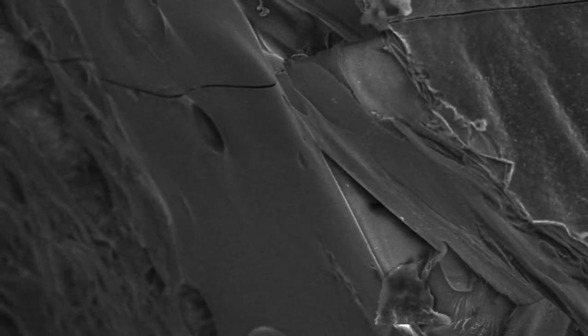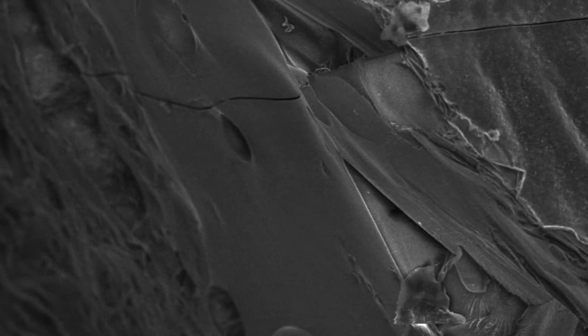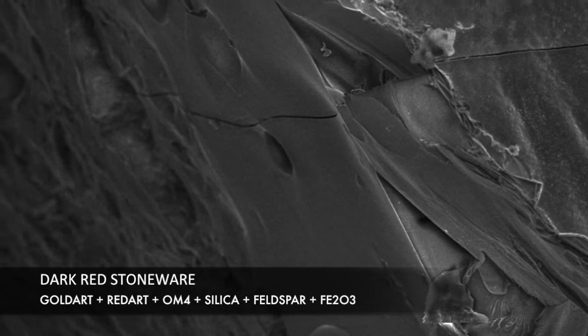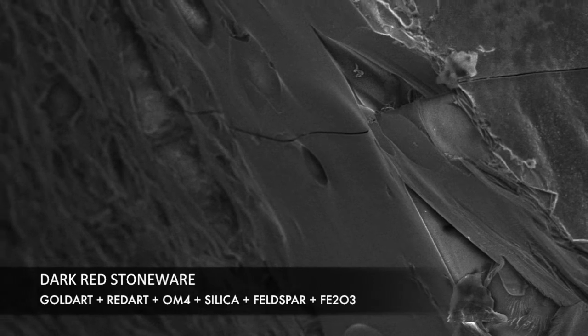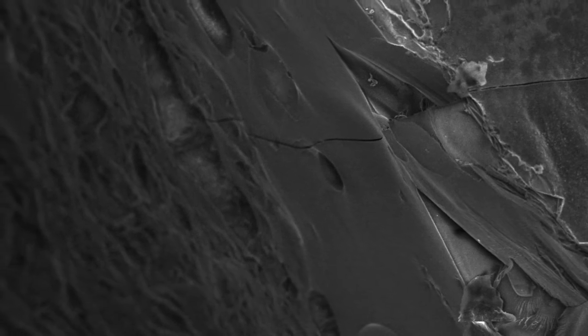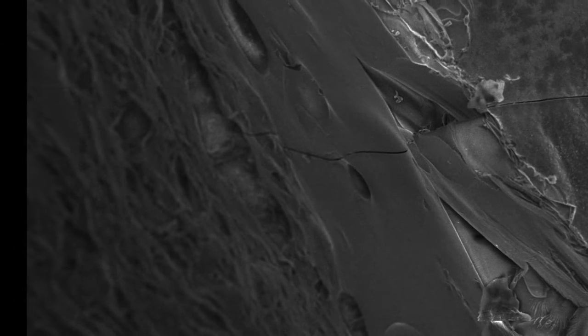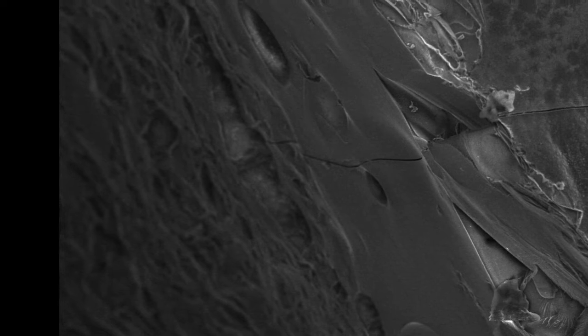And then as we move to the left, we can see the stoneware clay body itself. And as I said, if you have a clay body that is really high in iron and you're firing in oxidation, your clay body will actually start boiling and bubbling. And on the human scale, you can't tell that, but at the nanoscale, you certainly can.